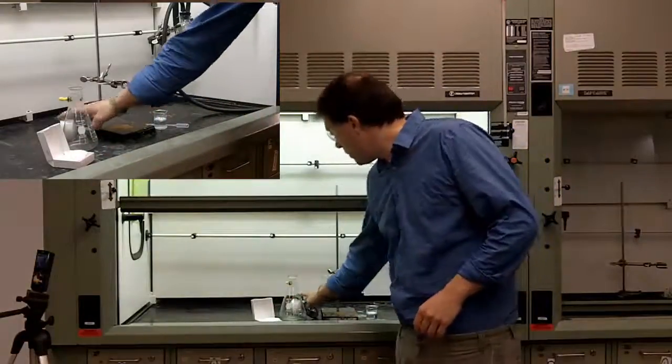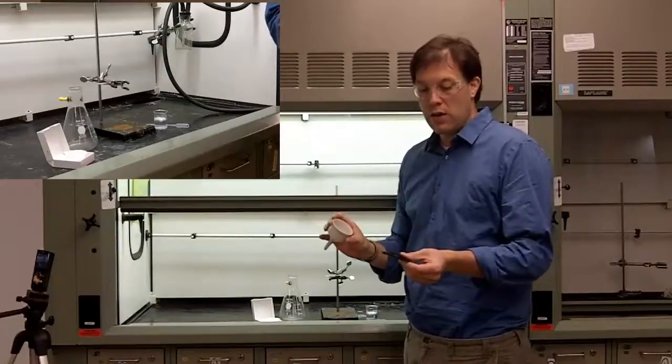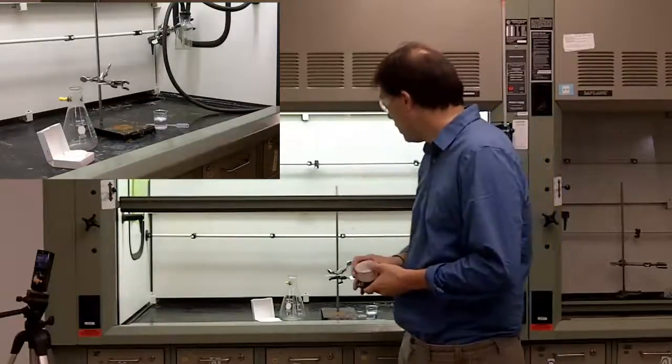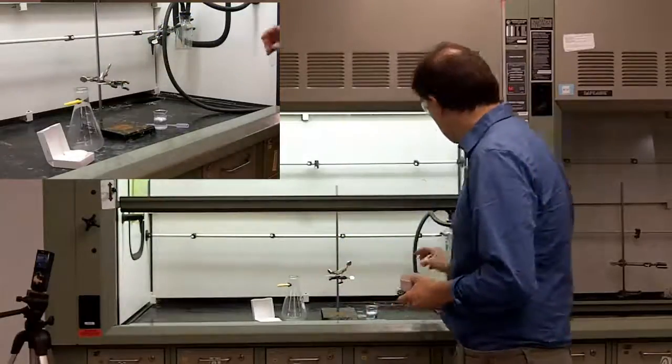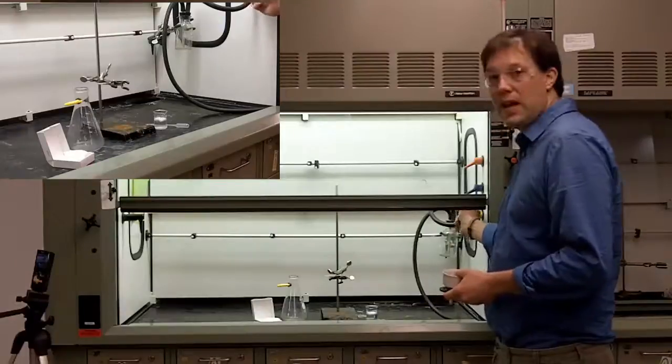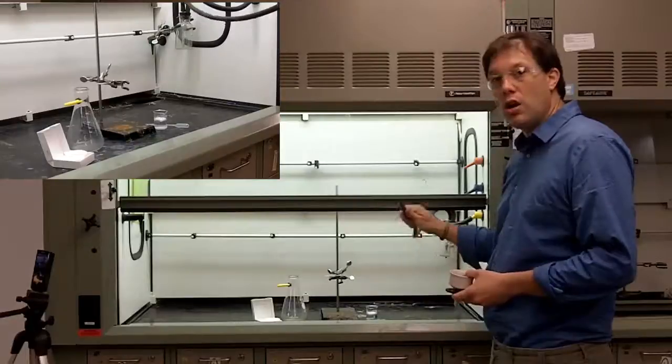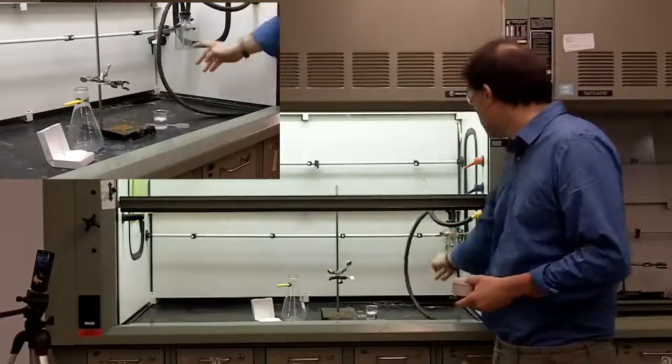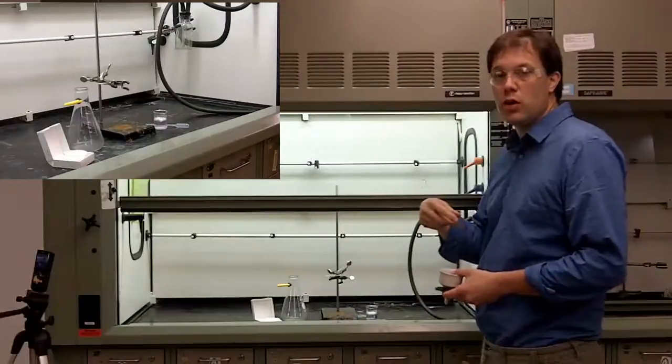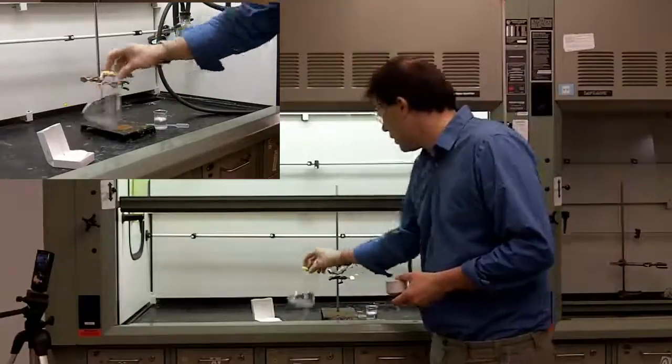You need filter paper, a filter funnel, and this black ring which helps create the vacuum to pull the air through the funnel, a sidearm flask, and a suction source which normally is a vent either on the bench top or inside the hood, and you should also have a trap attached to it. This is a trap that stops the liquid that you are filtering off from being sucked into the house lines and hurting them.